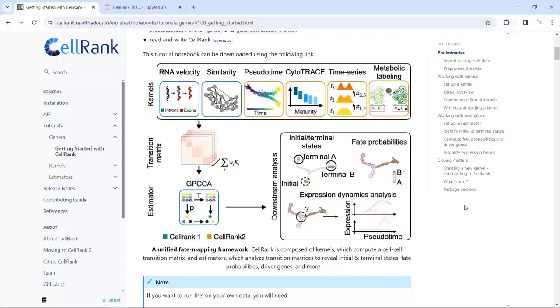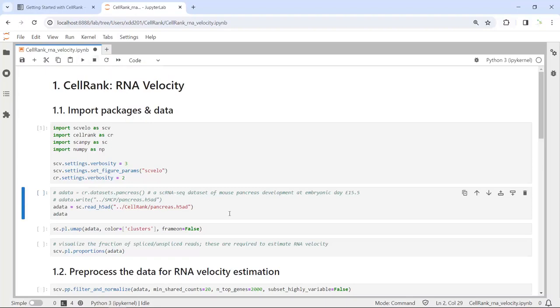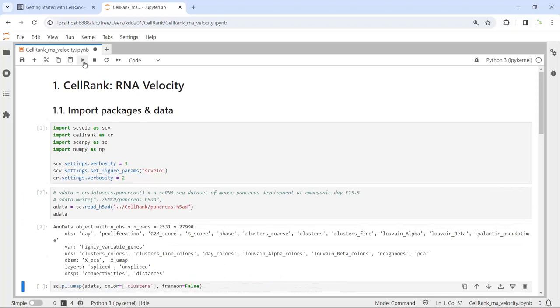In this video tutorial, we are going to do the RNA velocity analysis. Let's go to Jupyter Lab. Here is my notebook. First, we can import the packages for today's analysis. Then we are going to use the pancreas dataset as the demonstration dataset.